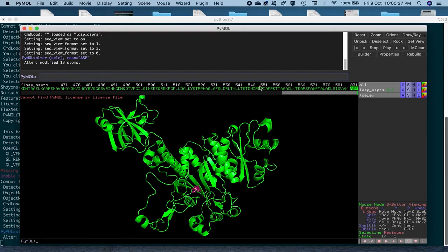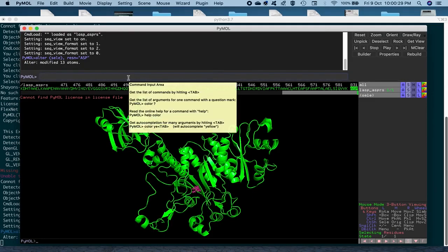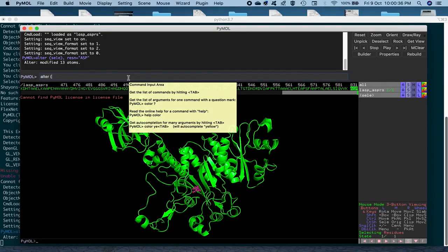The next thing that we will do is change the chain ID out here, which we can also achieve by using the same command, alter S-E-L-E, within brackets, comma.